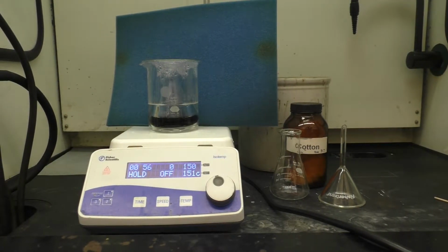Now that we've let the solution swirl in the hot water bath here for about 15 minutes, we're going to filter to remove the solid activated charcoal and leave us with our hopefully somewhat clarified solution. It probably won't be clear, but hopefully it'll be more like a light tea as opposed to the black solution that you see now.